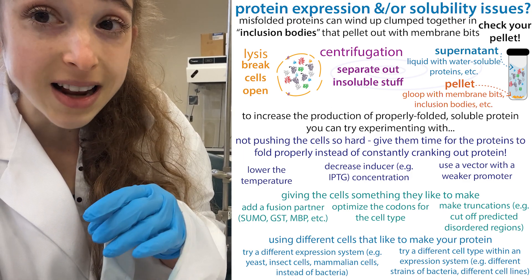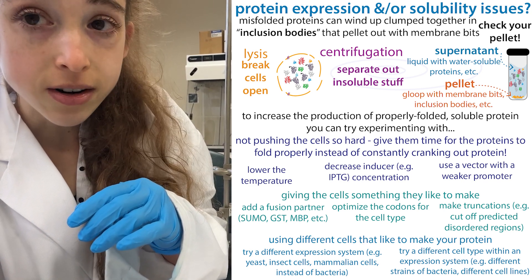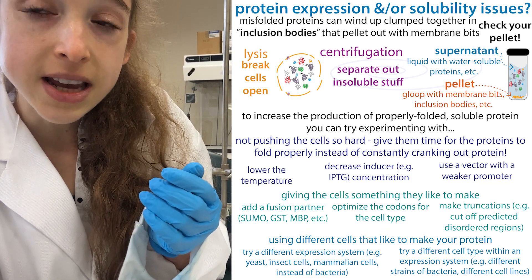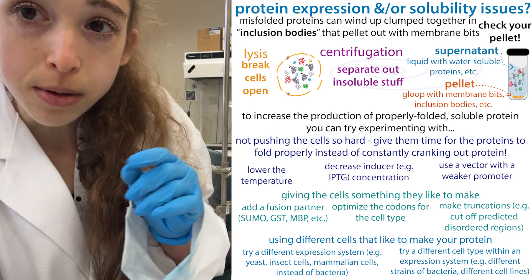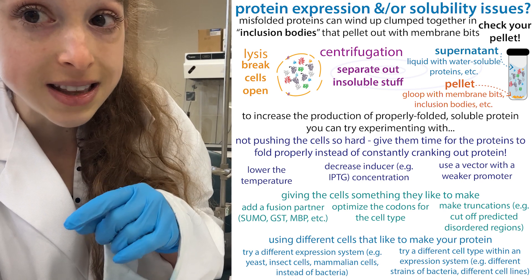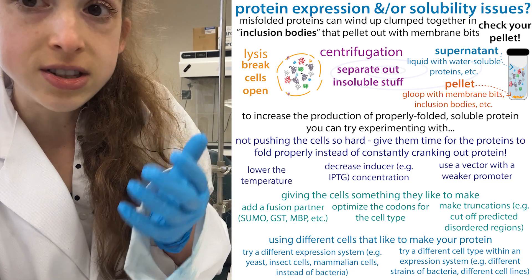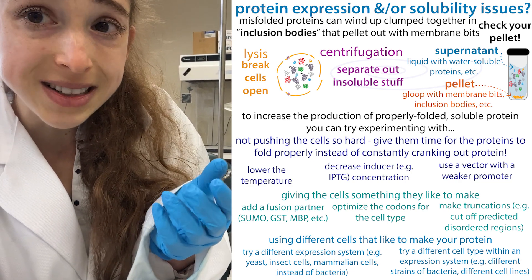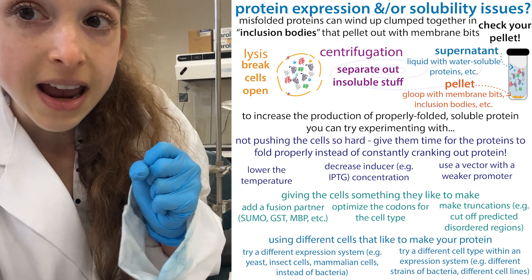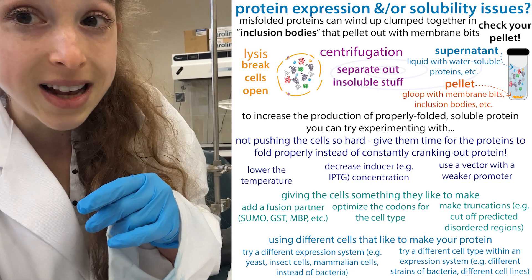If you hadn't actually lysed the cells well, the pellet is going to have full cells in it, and those cells would still have your protein in them. If you take a sample of the pellet and a sample of the supernatant to see where the protein is, there are two reasons why the protein could be in the pellet. Typically you'd test the pellet to see if your protein is insoluble — going to inclusion bodies, forming clumps or aggregates.